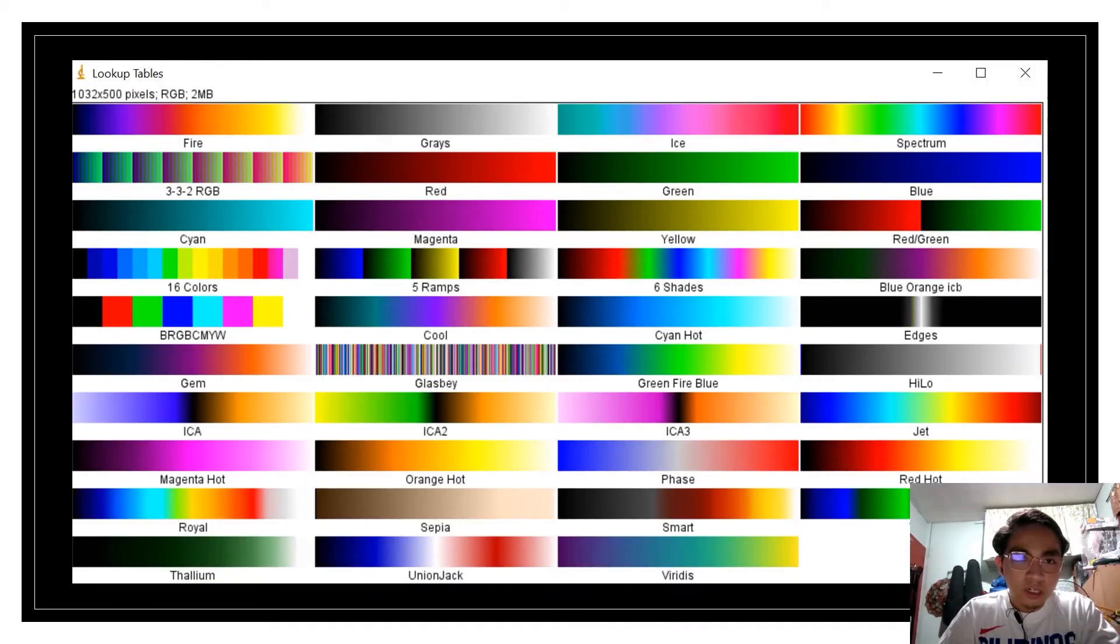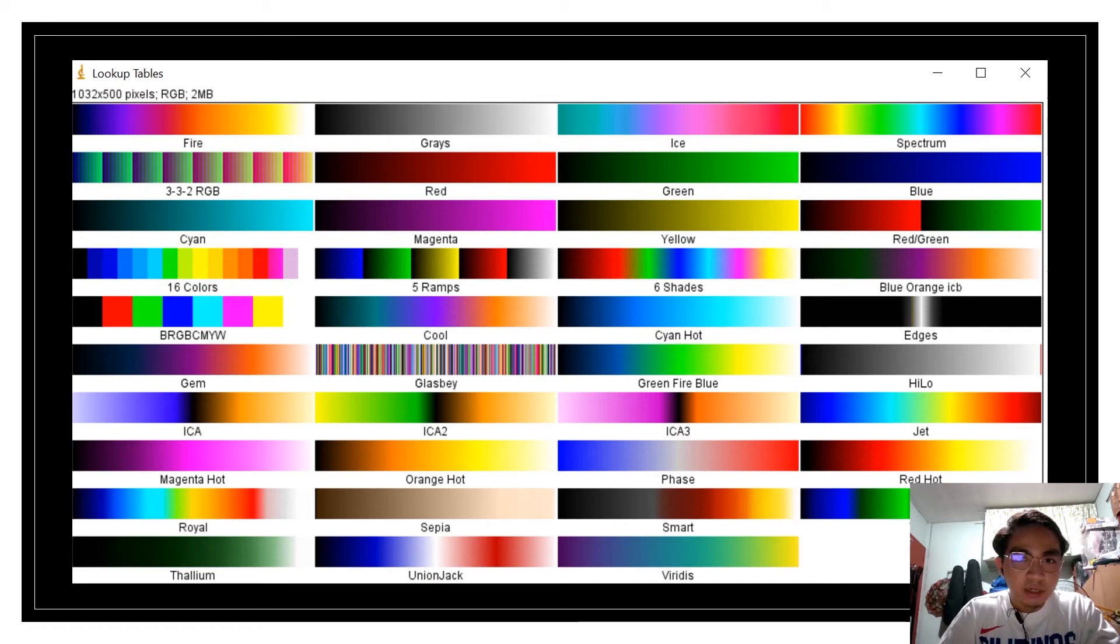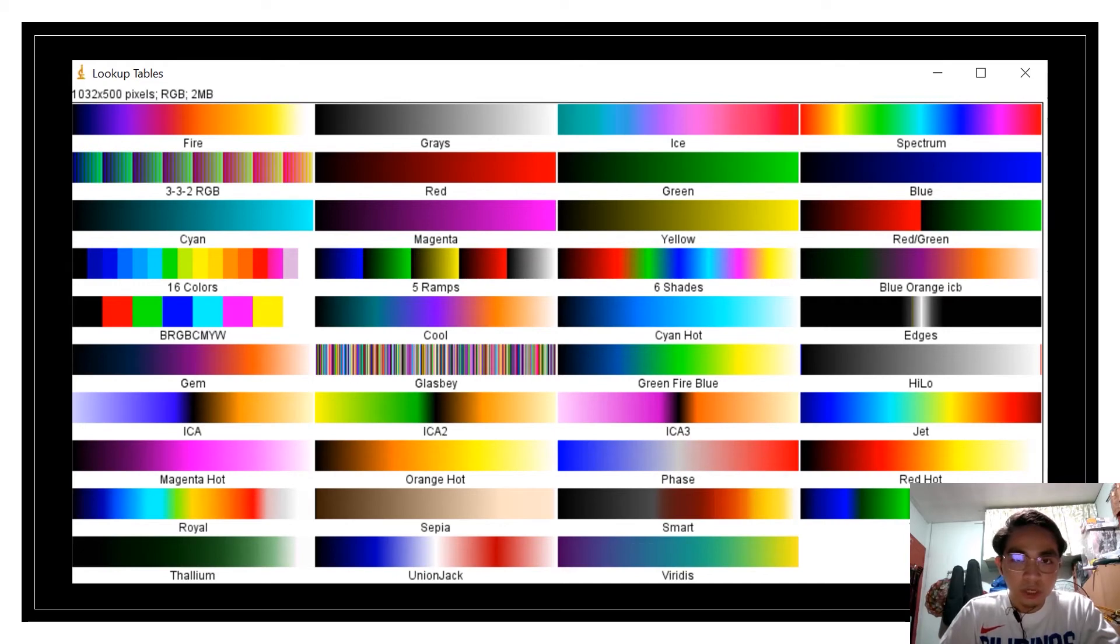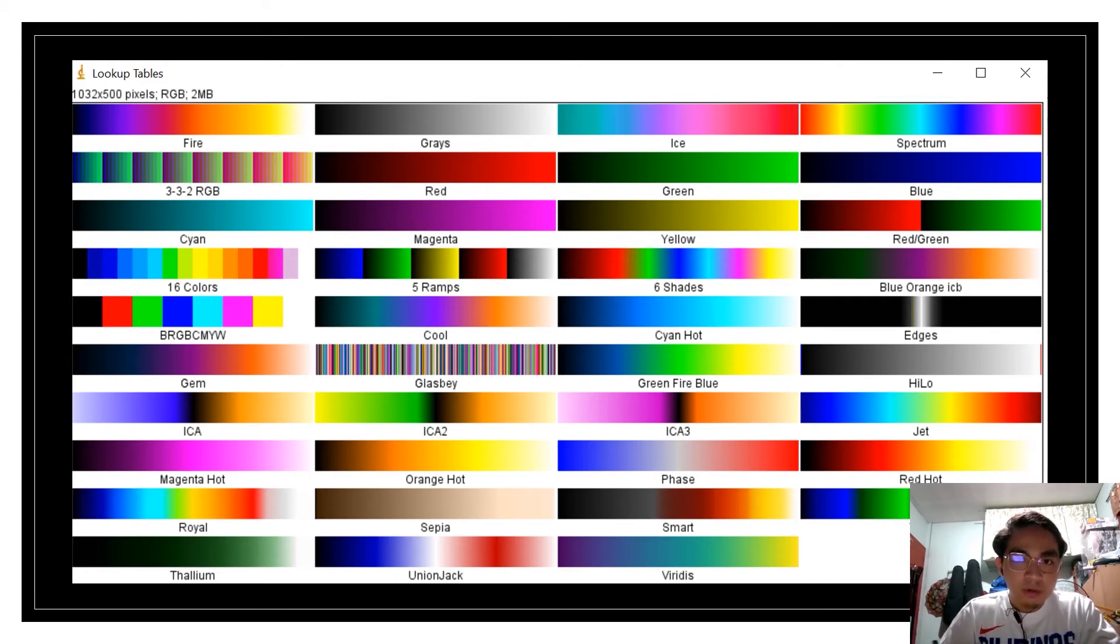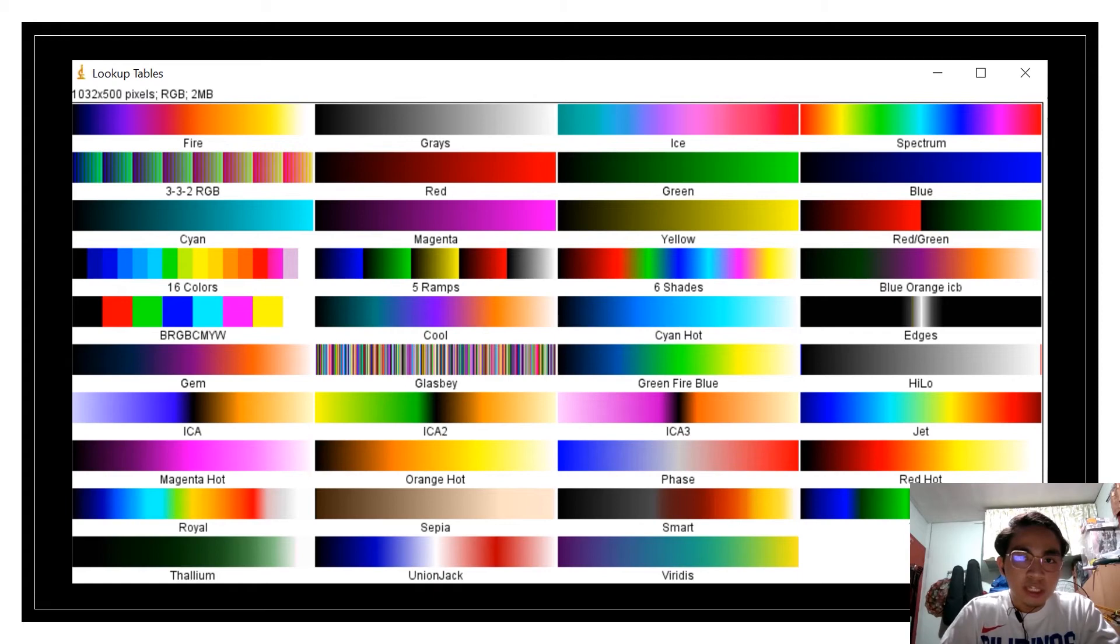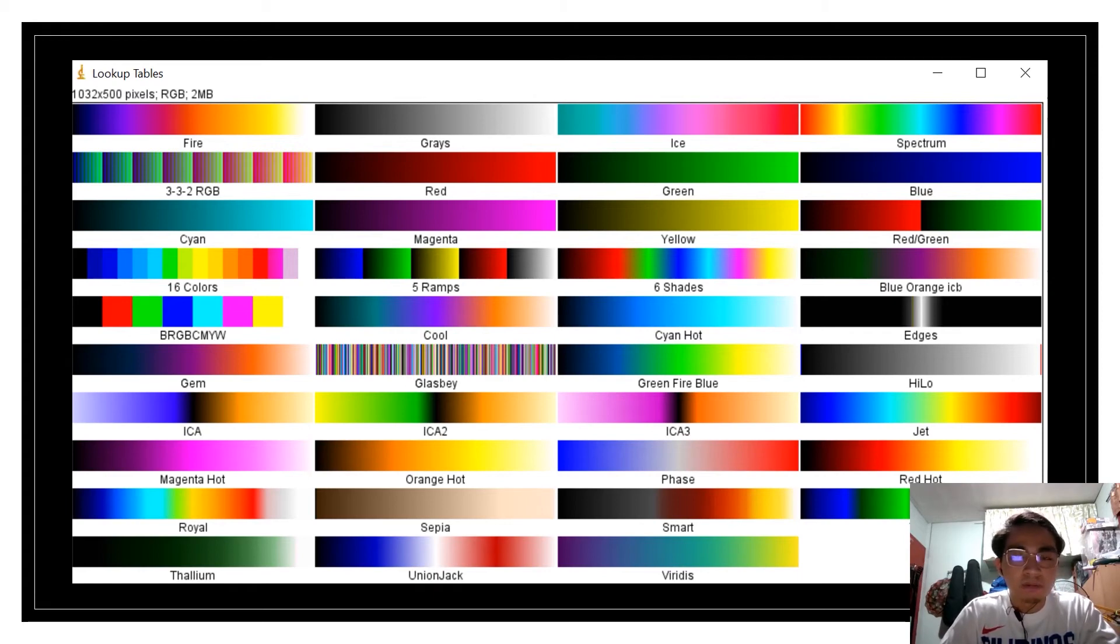Here are the lookup tables available in ImageJ. The problem here is for those people having difficulty recognizing colors or those with color blindness. One example is for red and green color dichromacy. One proposal is to use cyan, magenta, and yellow instead of your RGB color.